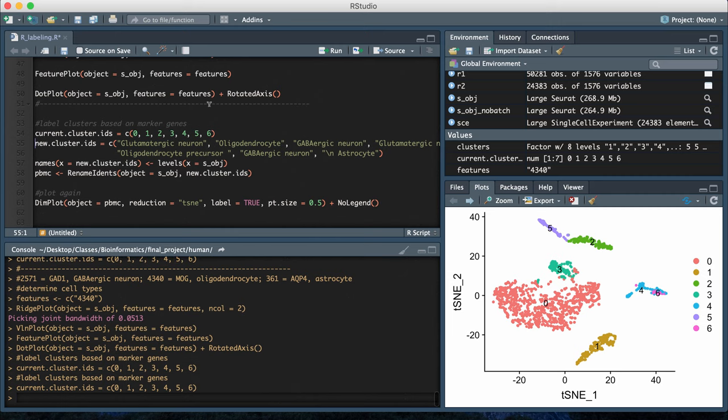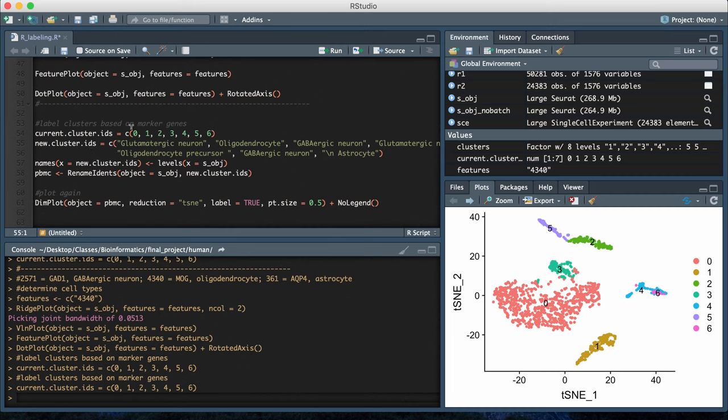The first thing I have here is a vector that has the original default cluster IDs, which are just numbers. In my particular case, my t-SNE plot currently produces seven clusters that are numbered zero through six.